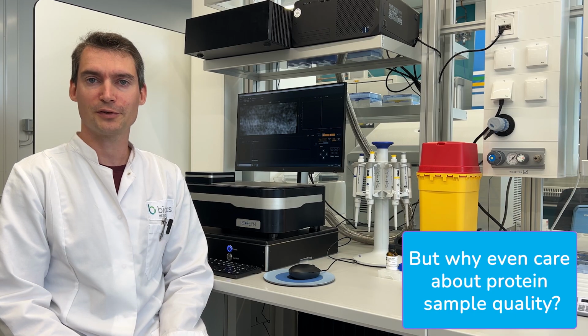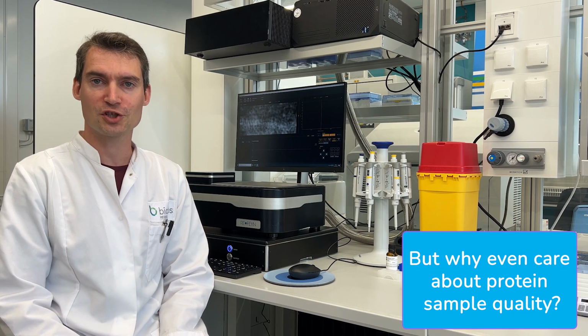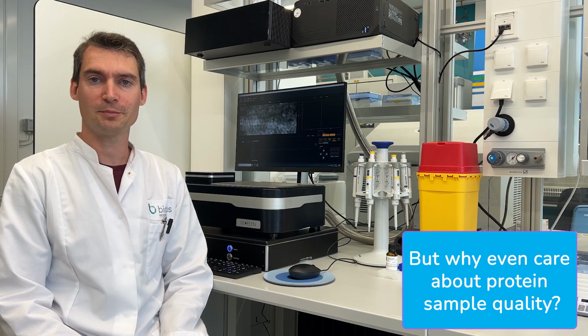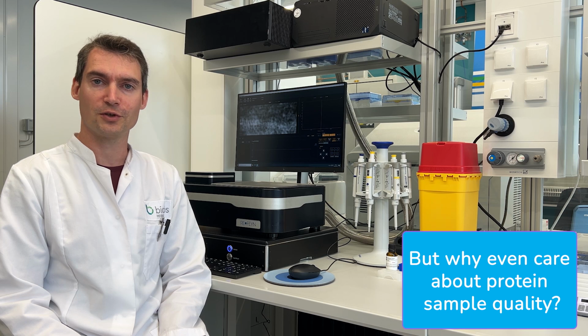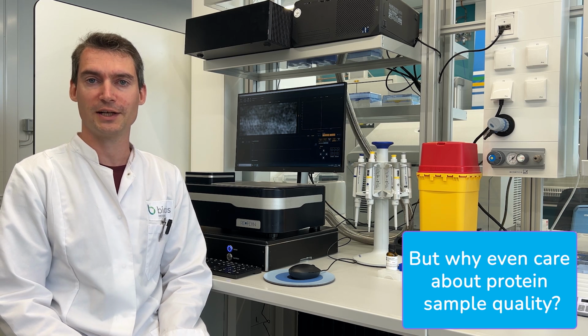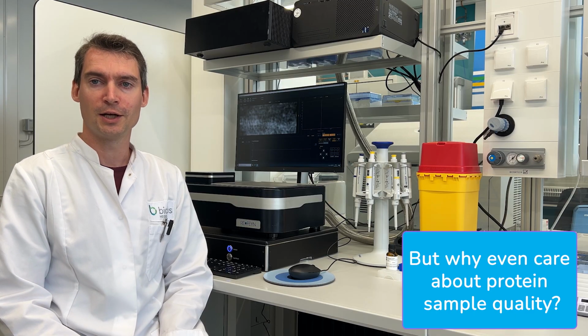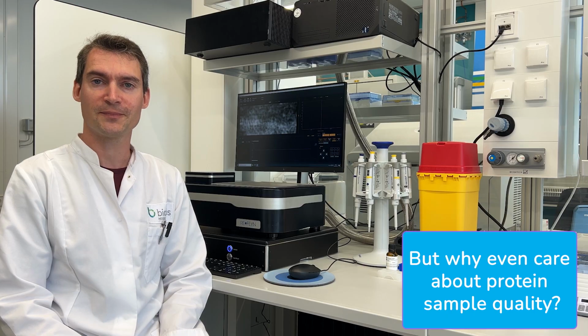You see, all of our structure determination methods rely in one form or the other on averaging the signal of millions of separate particles. So if we have impure samples, be it various conformations or even other protein impurities, then our primary issue is that this, for one method, introduces noise. For the other method, it might completely fail us, since in crystallization, an inhomogeneous sample might fail to ever crystallize properly and therefore stop us in our tracks.